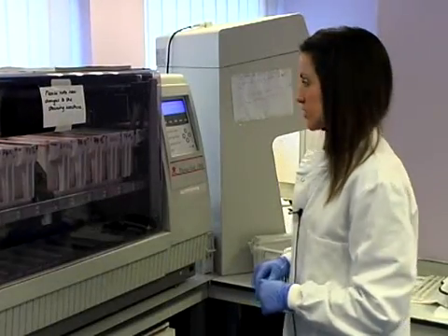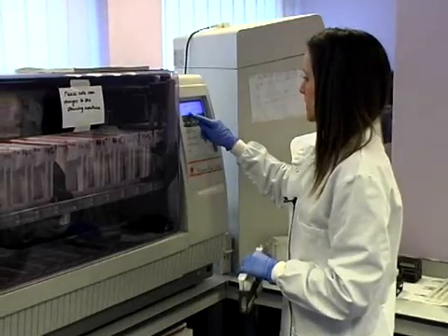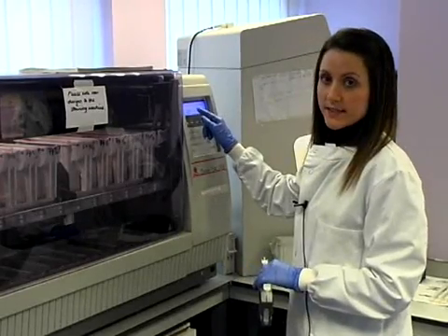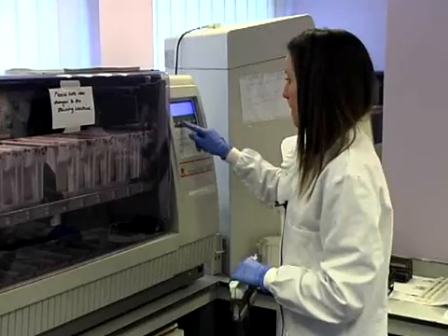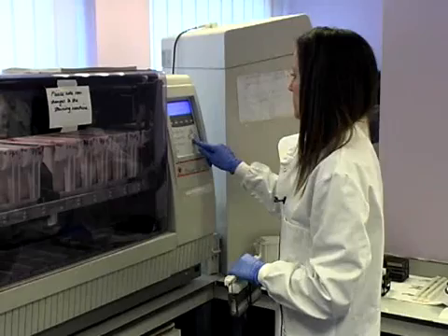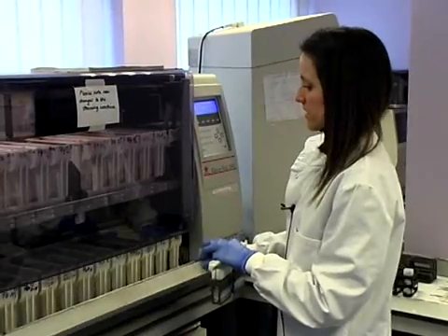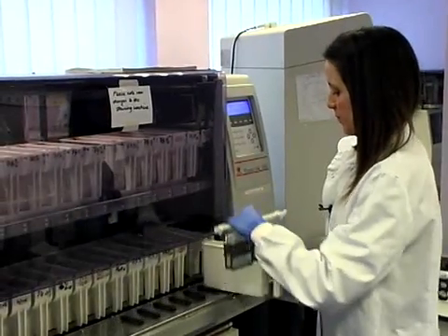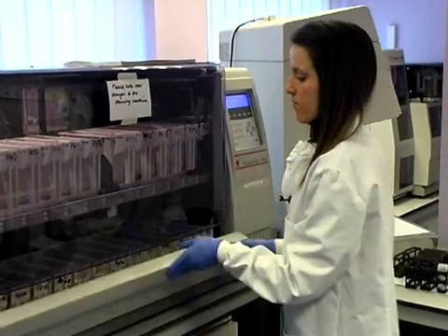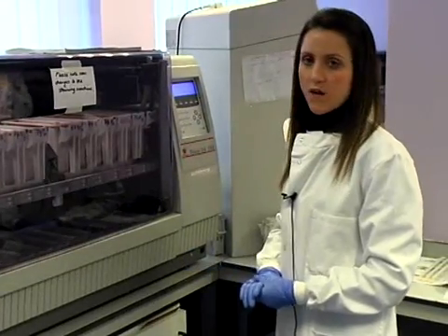Now we put the samples on. We click on the monitor screen where a list of different types of stains comes up, and we need to select the Papanicolaou stain, as this is what you use to visualise the cells for cervical samples. We click Start, choose the Papanicolaou method, select it — it tells us which basket to put it in — put them in the basket, 40 at a time, slide the basket back in, close the door, and press Start. The whole process takes about half an hour.